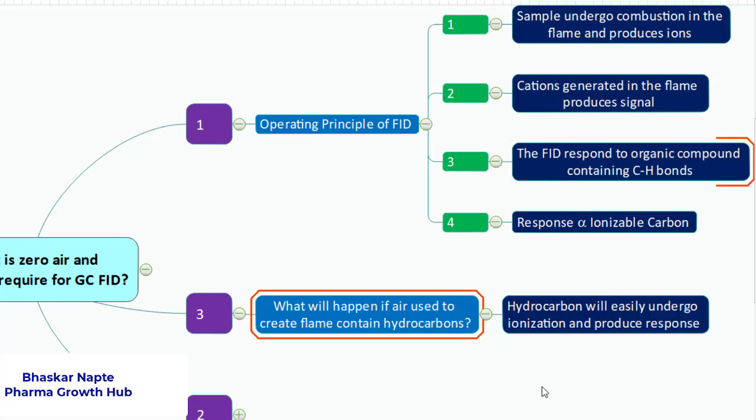What is going to happen? The air itself can give a response because of the presence of hydrocarbons, and the interference, the background noise, will come from the detector itself because of the hydrocarbons present in the air.